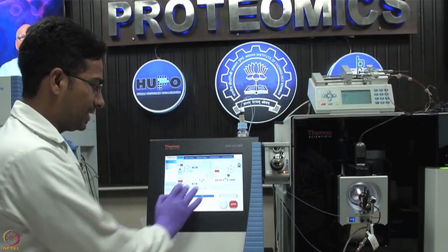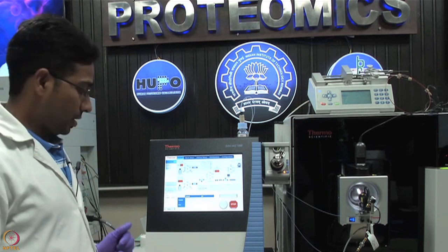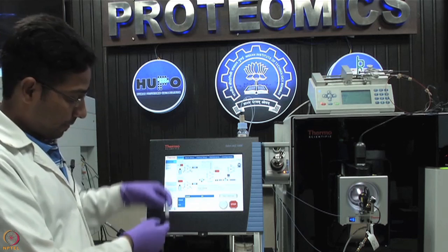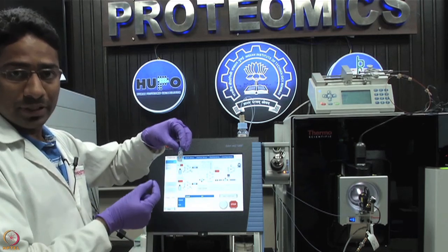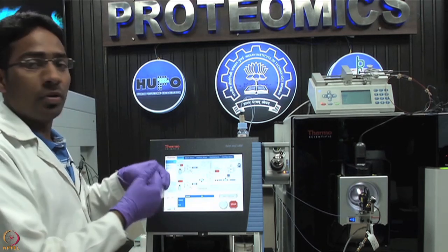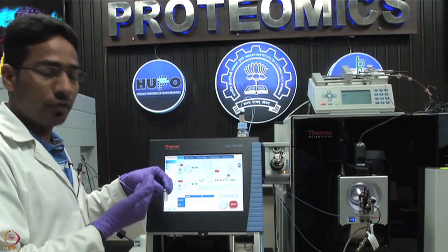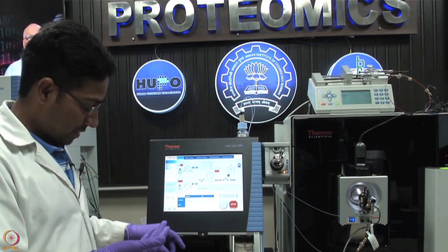Here I am ejecting the tray where you can keep your sample. You can see this plate, and this is the vial where you can keep your sample. Generally here we are loading around 1 microgram. Accordingly, you can calculate the volume you have to inject into the mass spectrometer.